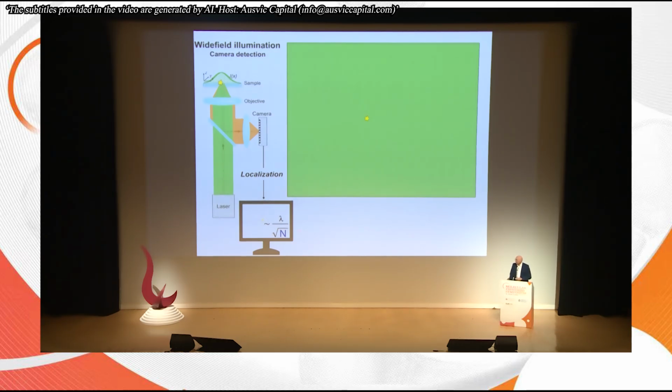In other words, the more photons the fluorescent molecule produces and you detect on the camera, the better you will find the position of the molecule within the focal plane, because this position on the camera directly correlates in space with the position of the molecule in the focal plane by simple geometrical optics. This kind of concept has been used in many biophysical applications when it was important to find the position of a fluorophore, and also in so-called single molecule-based super-resolution fluorescence microscopy.